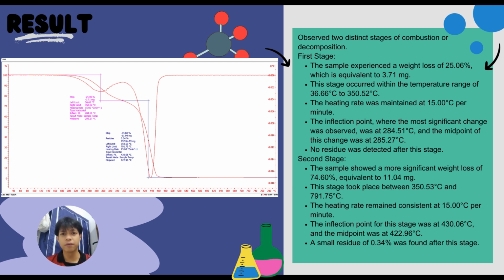The inflection point for this stage was at 430.06 degrees Celsius, and the midpoint was at 422.96 degrees Celsius. A small residue of 0.34% was found after this stage.